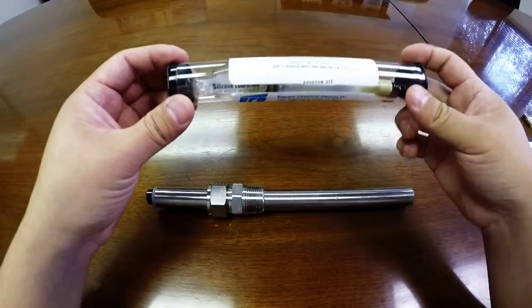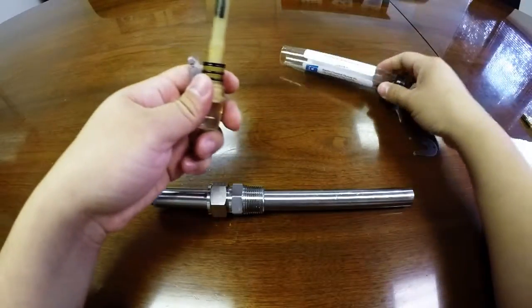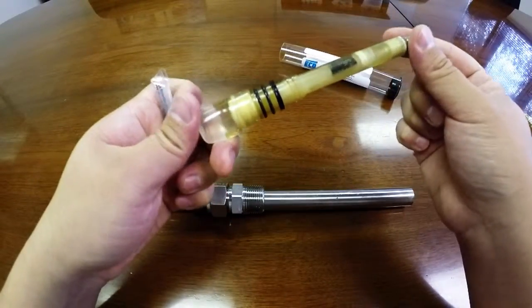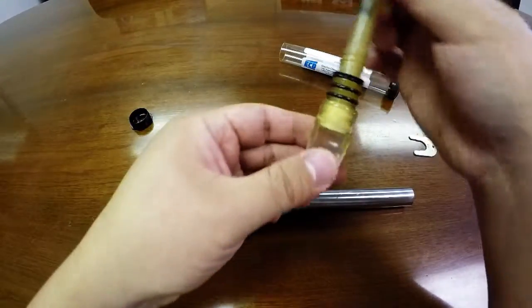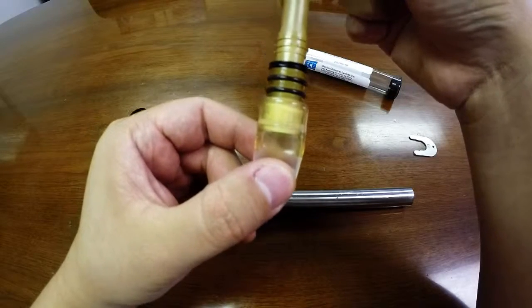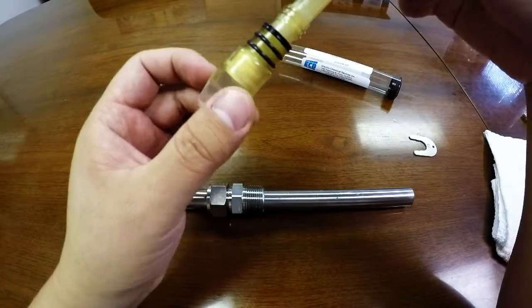Replacement electrodes come in a protective tubing. You will have your replacement electrode and silicone lubrication. The electrode will also have a solution boot, which is to prevent dryness of the electrode.